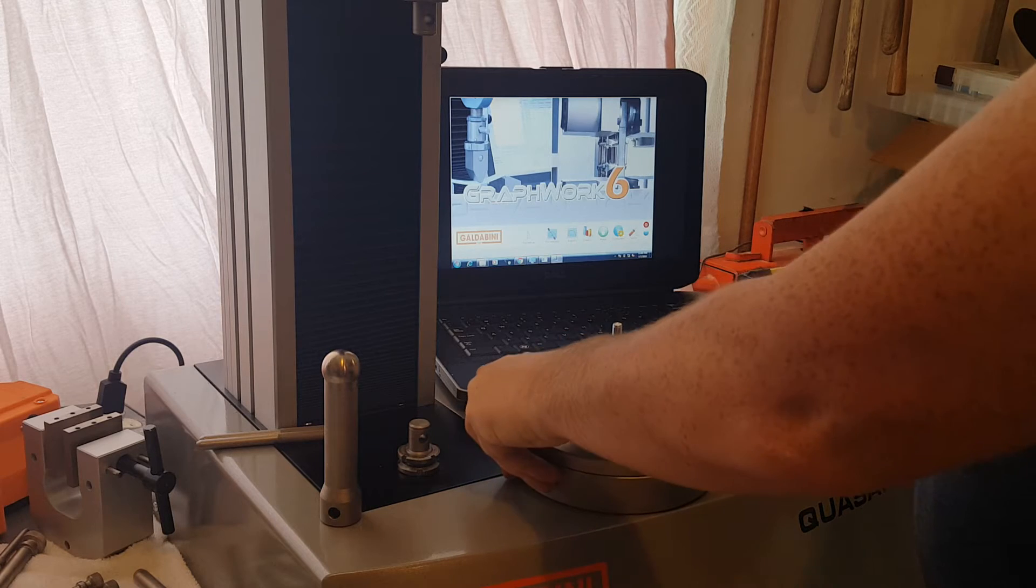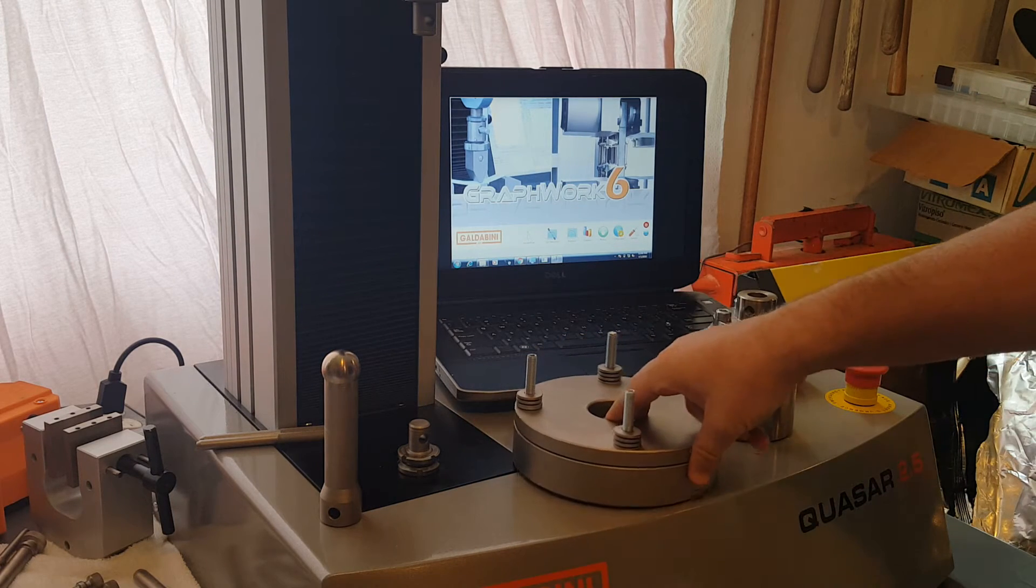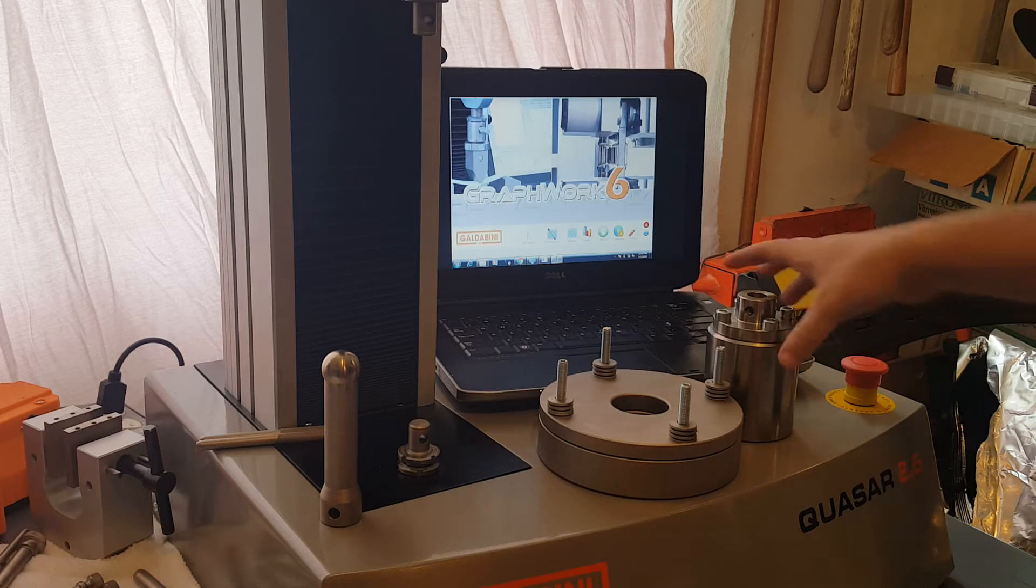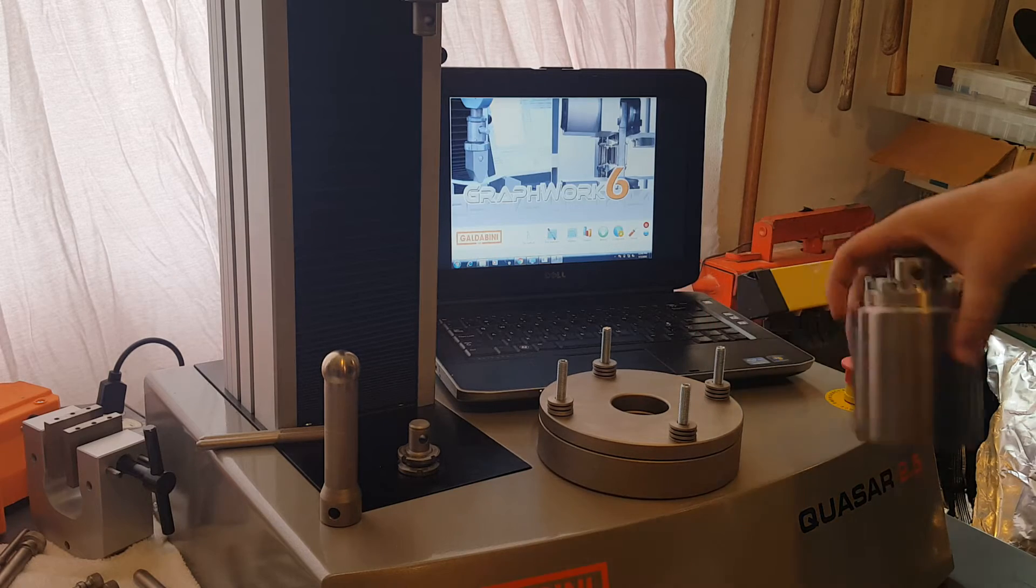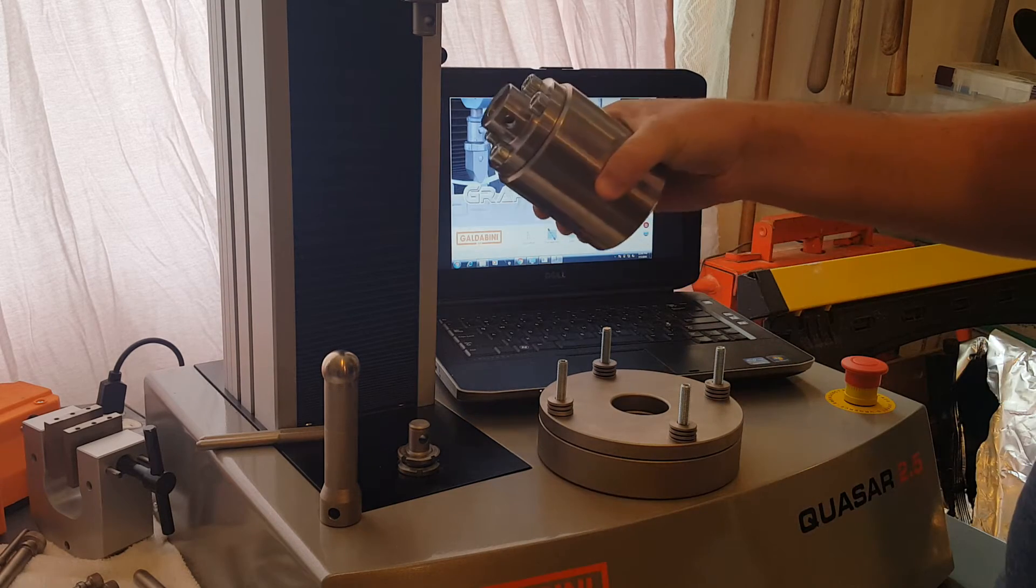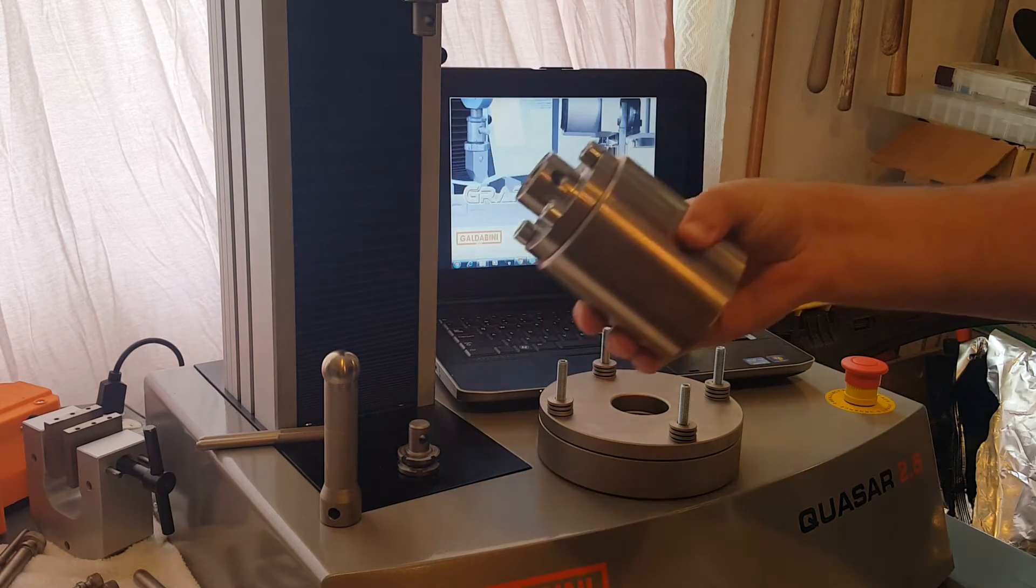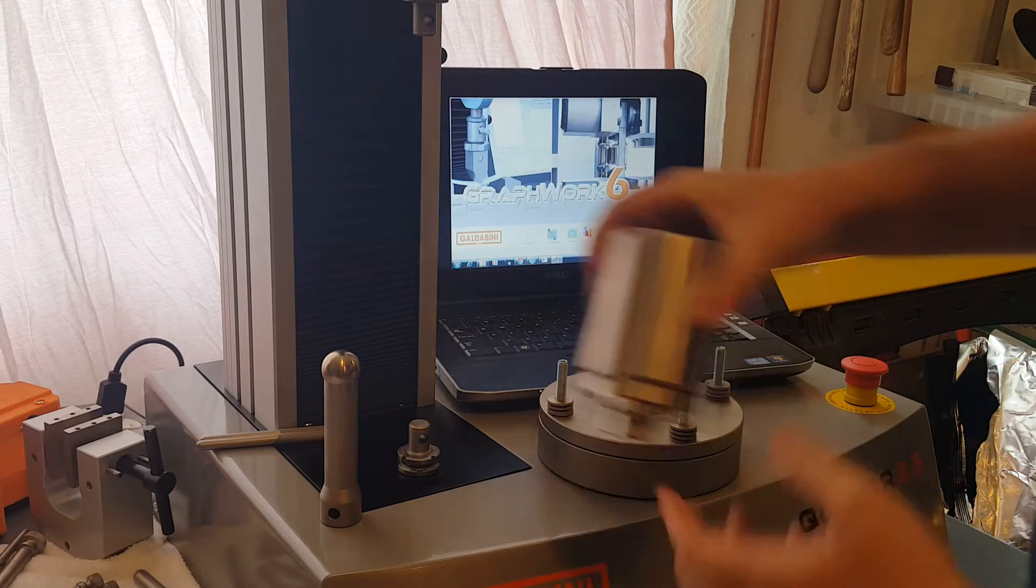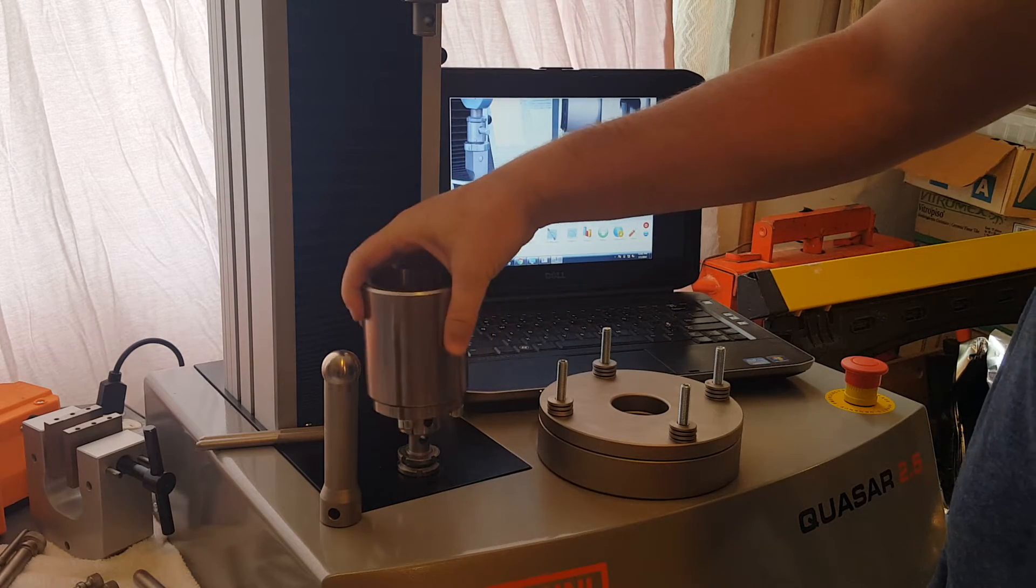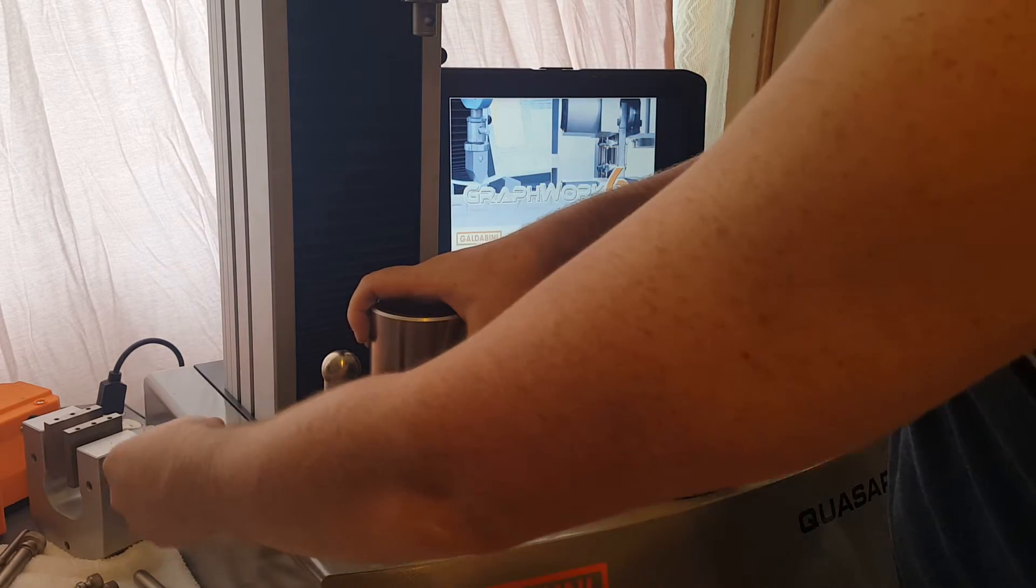We're going to be mounting the puncture fixture onto our Galdabini universal testing machine. First we'll start with the base. It uses a standard clevis pin style adapter that's featured on all of our grips. It slides right over the eye ends.